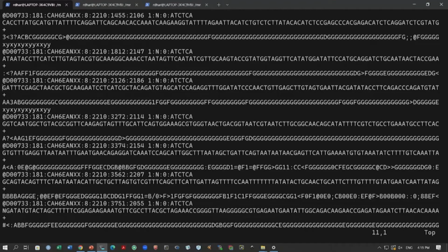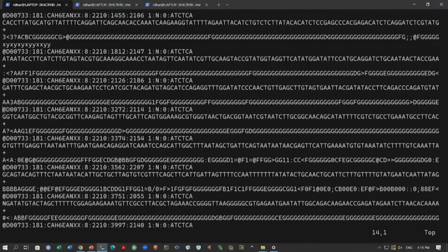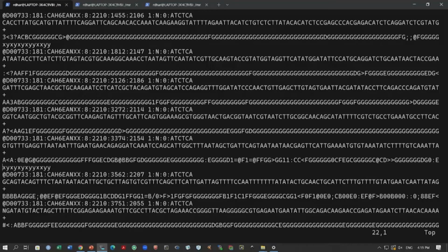There is also cut paste. That works by saying dd, small d's, twice. If you press this, the line will be cut, and if you want to paste it somewhere here, you can press P and it will be pasted here. Now, this is copying one line or cutting one line.